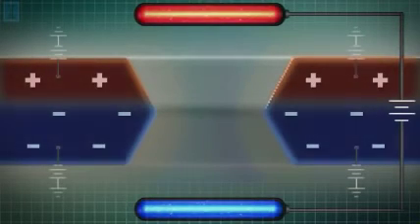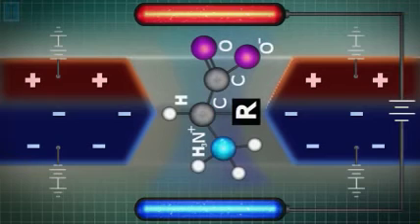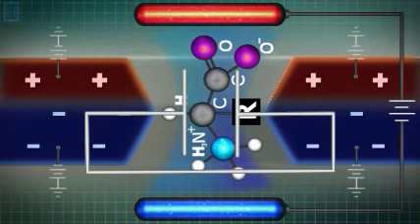Furthermore, we can create multiple areas of different charges on the membrane. This additional parameter can be used to trap specific entities with known net charge zones. In this case, we have trapped a simple amino acid in the pore.